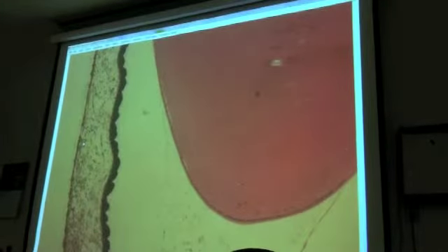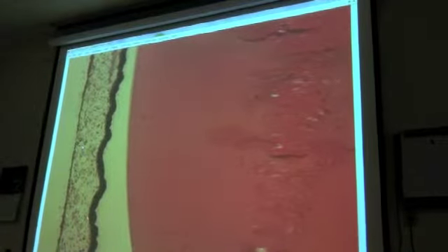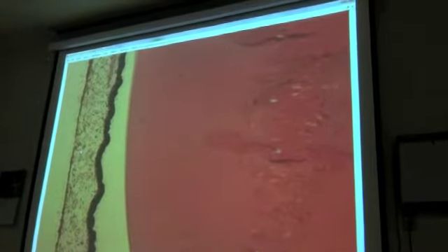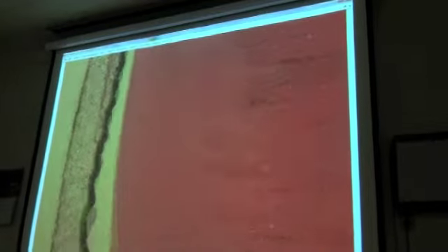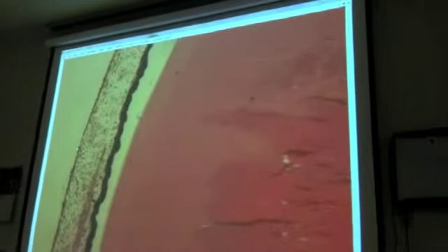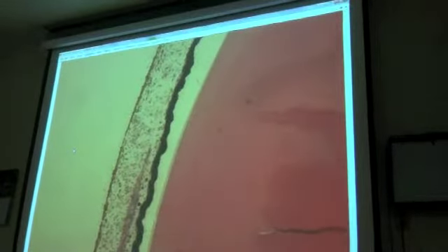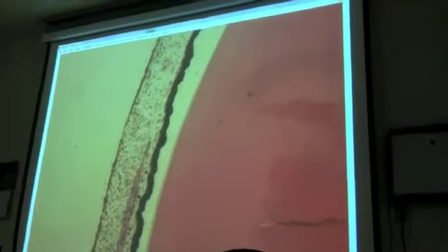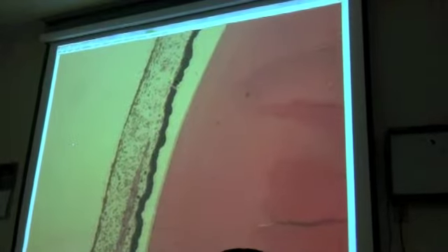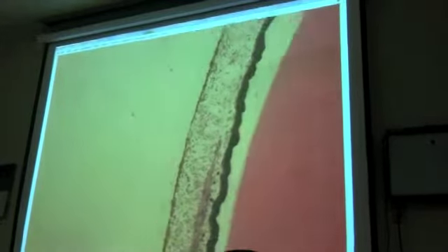So if the pupil was on this, we'd see the iris come to a nice point. We'd see nothing in front of the lens for a while, and then we'd pick up the iris on the other side. Okay? Now, we're in the anterior cavity here. Don't be confused if you're looking at pictures and they talk about chambers. There is an anterior and a posterior chamber to the anterior cavity. I don't make you differentiate them anymore.